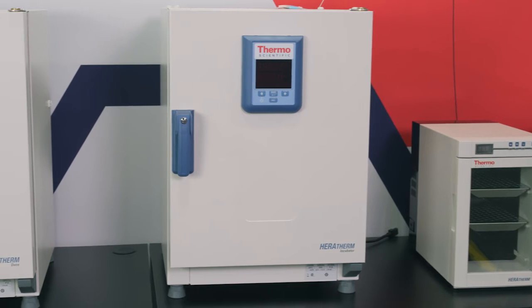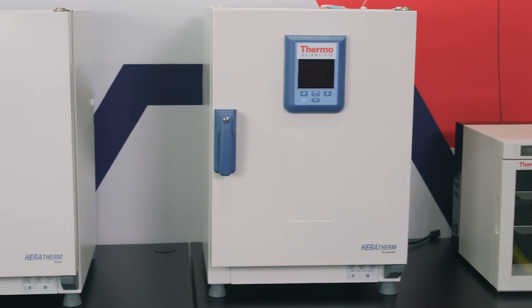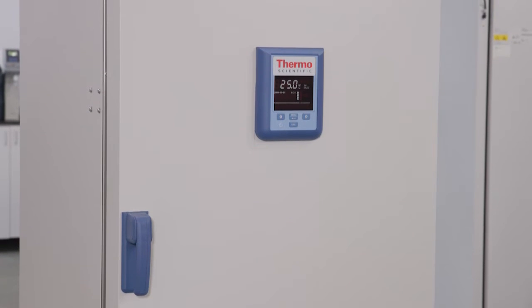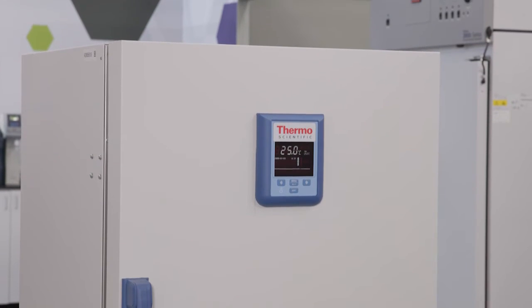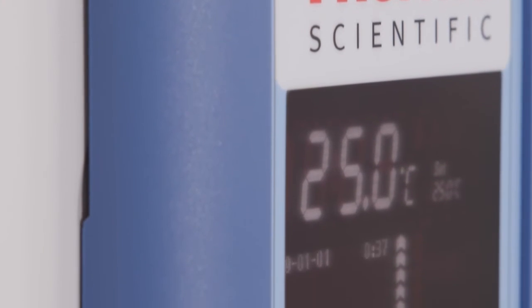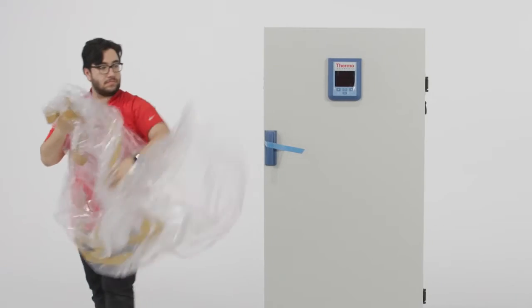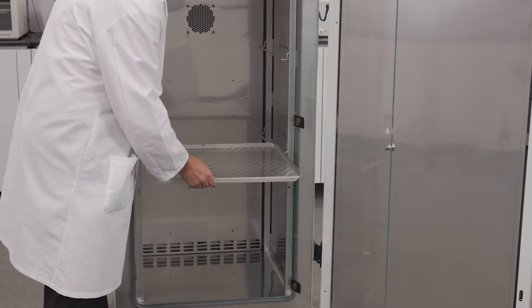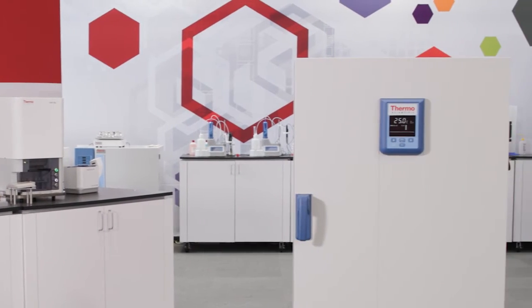Available as a stackable 180-liter benchtop model or a 400-liter floor-standing model, our flexible size offering ensures there is a Heratherm solution to meet your analytical testing requirements. Today, we'll show you how to unbox and install the floor-standing Thermo Scientific Heratherm IMP400 refrigerated incubator.